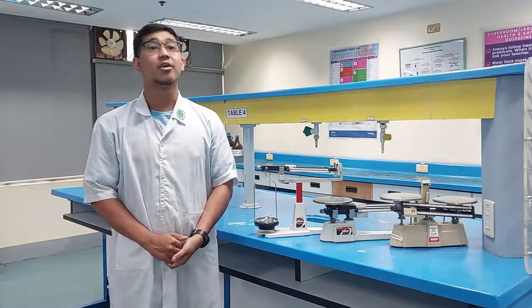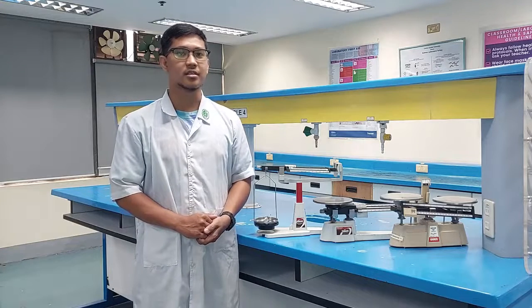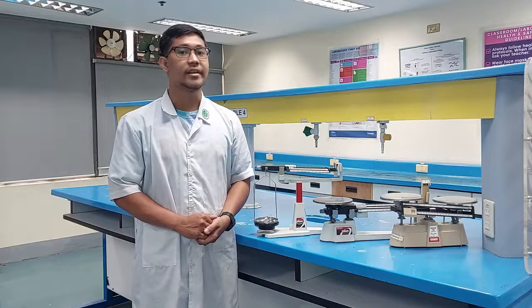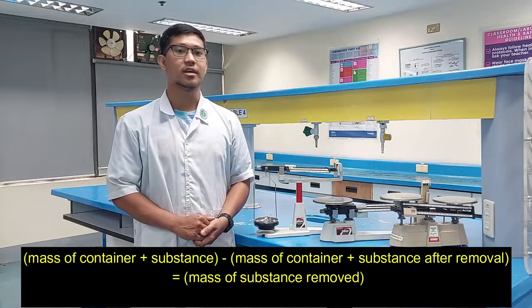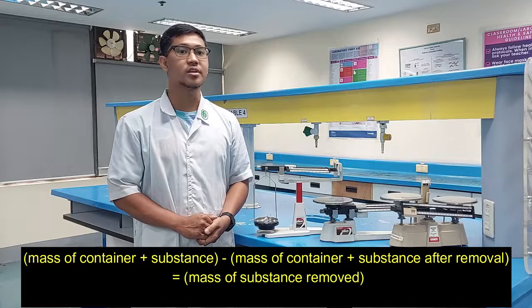Second, a container holding the substance of interest is placed on the balance and weighed. This is the first reading. The substance to be used is removed from the container and the container is weighed again. This is the second reading. The mass of substance taken is determined by subtracting the second reading from the first.